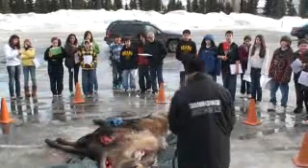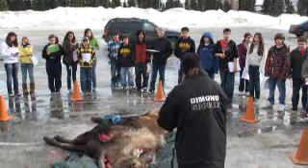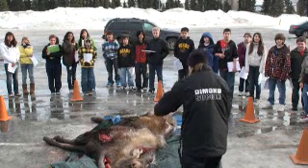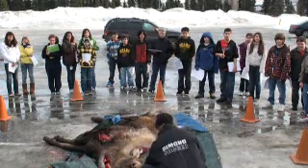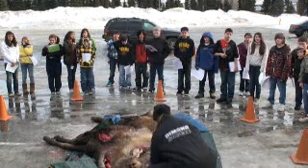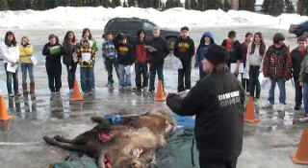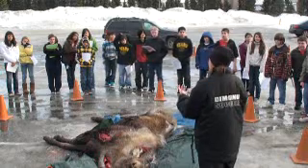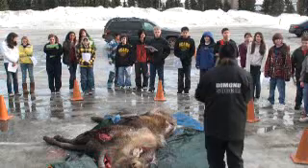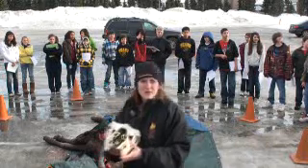This one's busted off. This is a skull that I actually found over by Spencer Glacier. This was also a winter kill. It died during the winter time. This part comes down, and there are bones that run down the front of the nose. This whole top area and down is the nasal cavity. Nerves and soft tissue will be in this area to help magnify their sense of smell. Very sensitive nerves so that they're able to sense different smells around them.